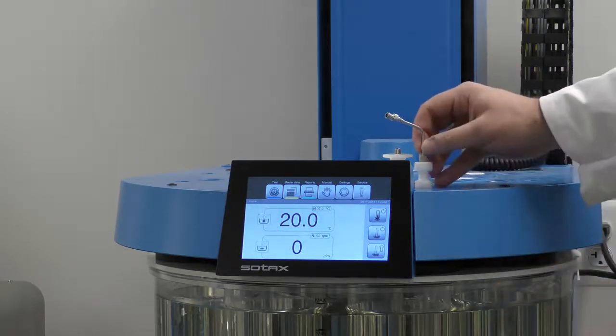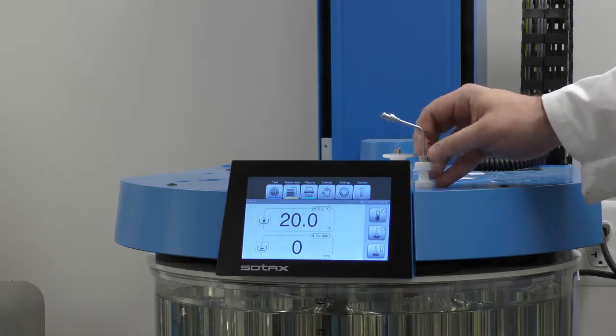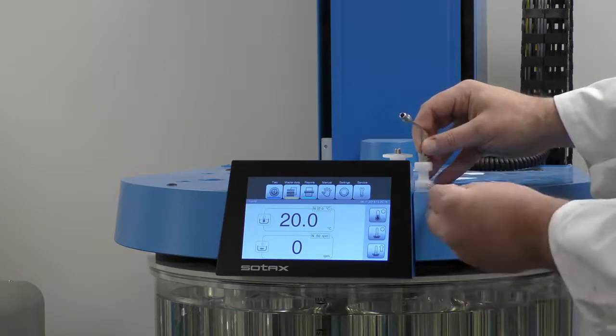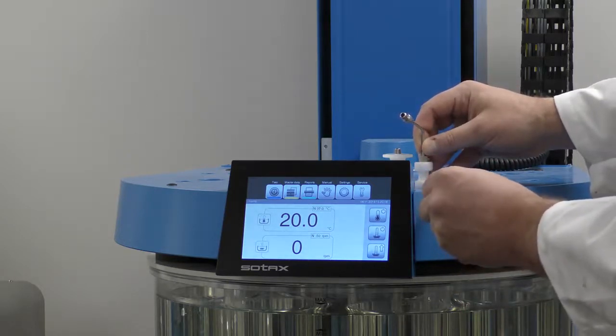Once we've determined our sampling position — either 500 or 900 — here I'm going to use 500, so I push the collar all the way down and tighten the set screw right here.